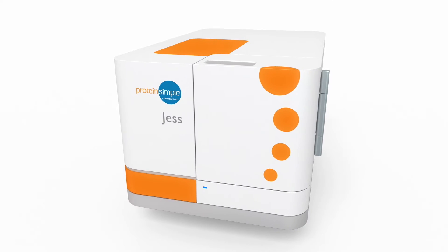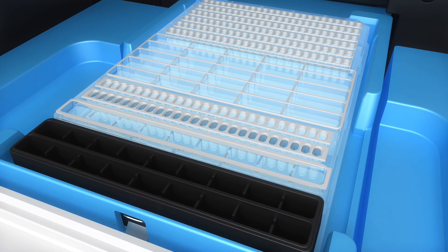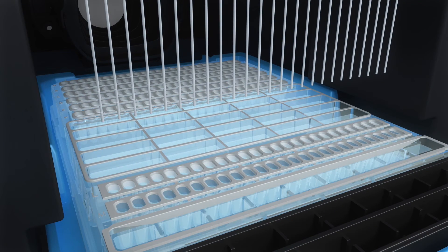Simple Western immunoassays take place in a capillary. Your sample, separation matrix, stacking matrix, antibodies, and reagents are loaded automatically from a specially designed plate.